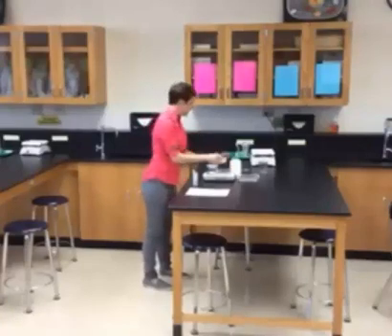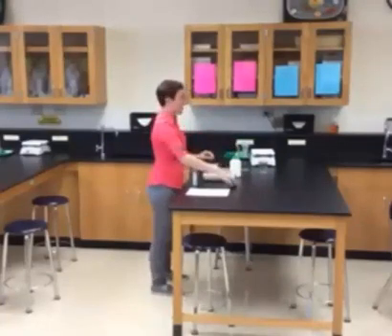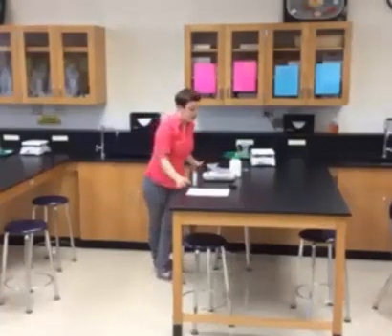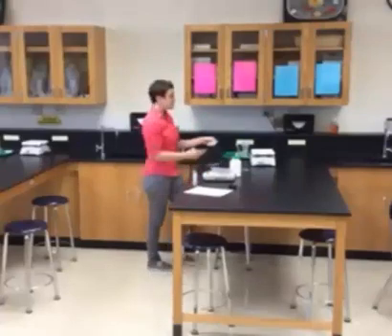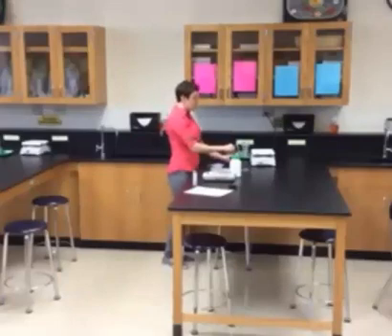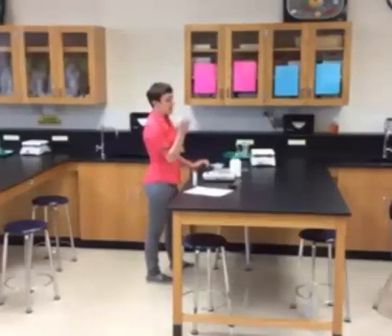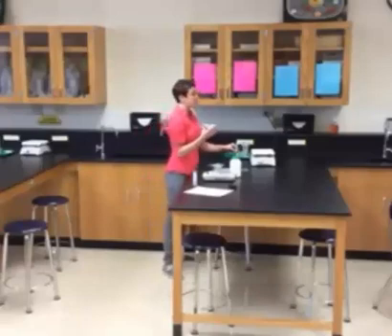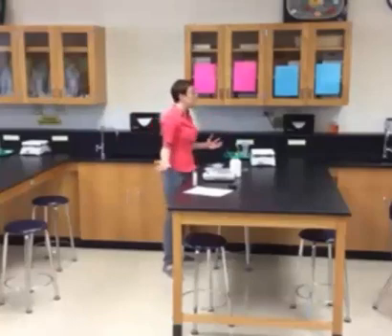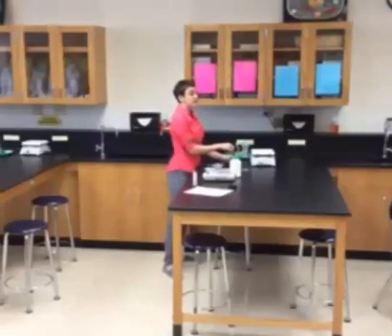Once you've measured everything into your weigh boat, you can turn off the balance, put the top back on, and unplug it. Assuming the water has boiled and is set to the side, step four says add 18 grams of Jell-O to the beaker and stir using the stir rod until it's all dissolved — make sure you get any gritty pieces off the bottom. When that's done, slowly, one person should add and another person should be stirring the washing soda a little bit at a time. If you add it all at once, it's going to bubble out everywhere and create a sticky mess. So add slowly and keep stirring until everything is dissolved.